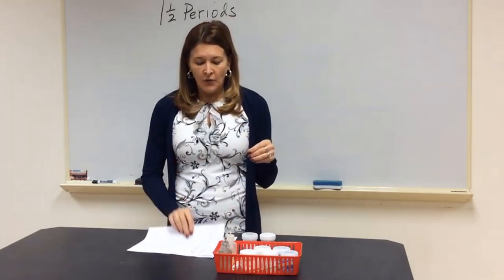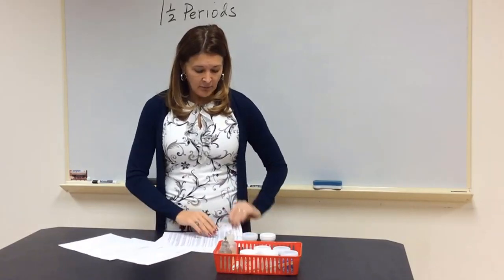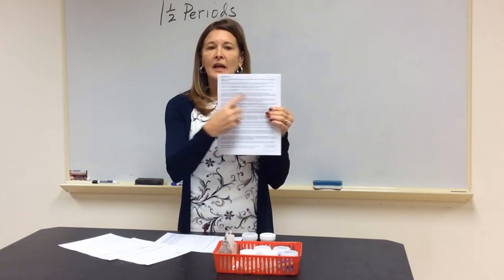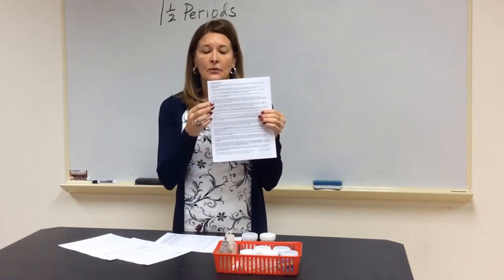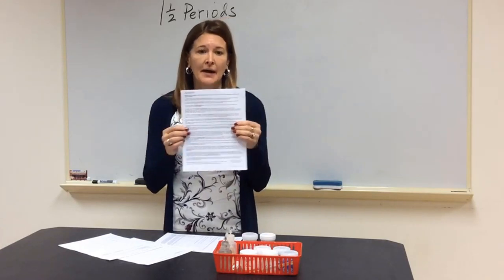Now, for this lab, since you're doing lots of individual reactions, if we look at the procedure page, there's lots of individual reactions. Make sure, again, you thoroughly have read everything to see if you need to save anything for future steps. But there will also be a lot of cleanup at the end of this lab, so keep that in the back of your mind.